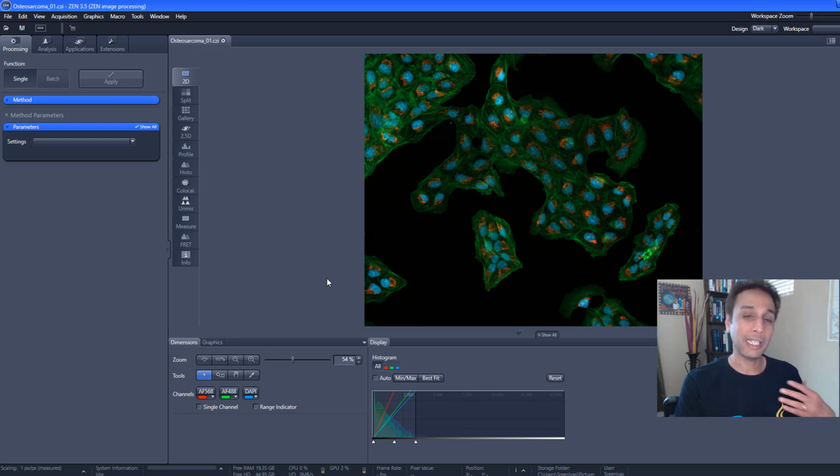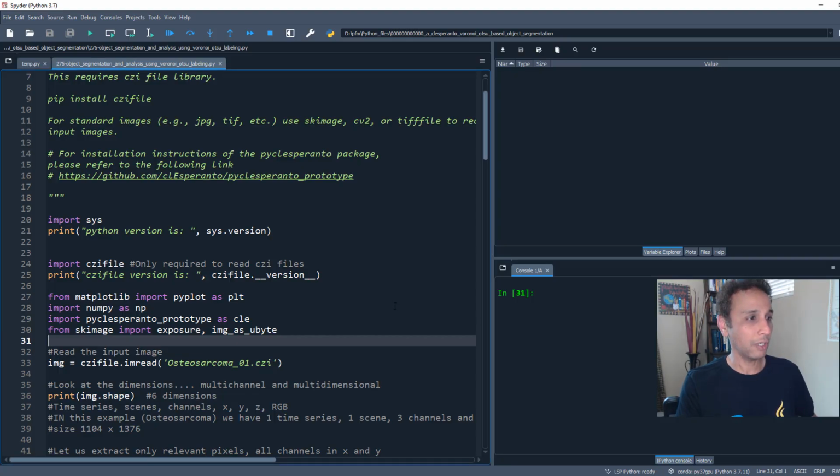If you have a multi-channel satellite image, because you may be imaging under multiple bands, select the band of interest and then go ahead and perform these analyses. Anytime you are dealing with scientific images, the images are not just JPEG or PNG because they need more dimensions to capture additional information. There you go, a little bit of scientific information. If you're a non-microscopist, hopefully you'll appreciate that.